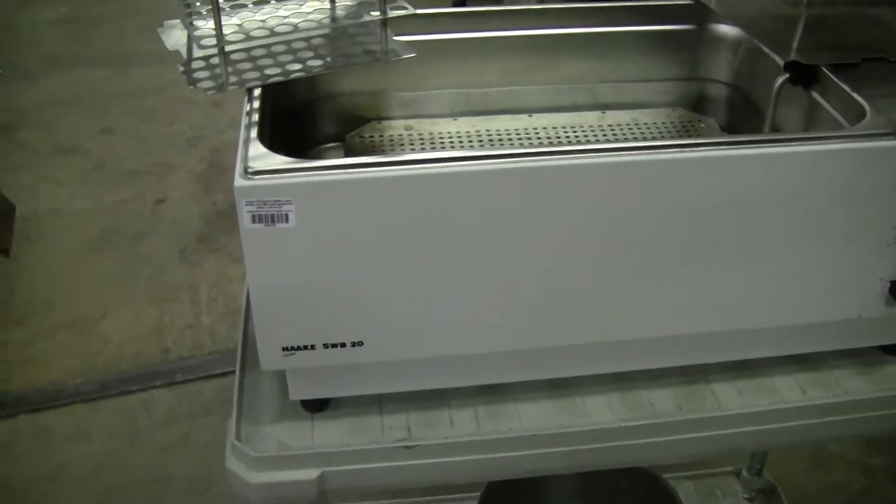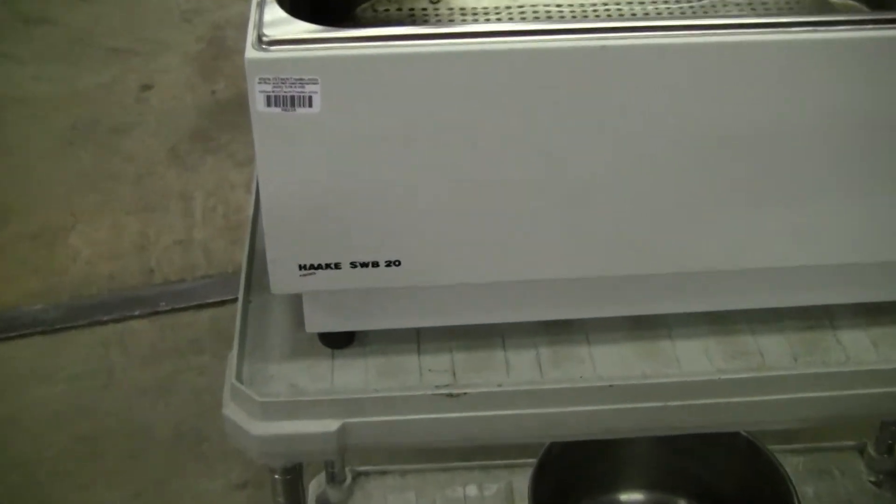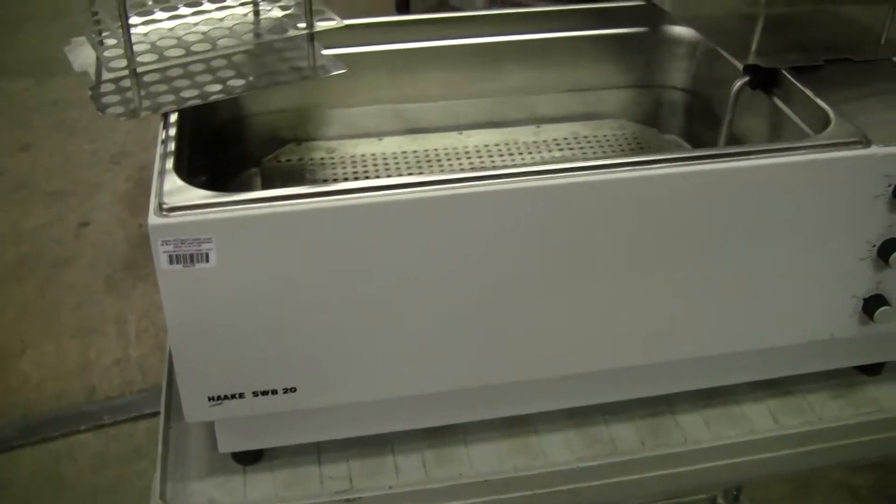Hi, this is Michael Naitow from Hi-Tech Trader. Today we're looking at the Haake SWB20 Shaking Water Bath.